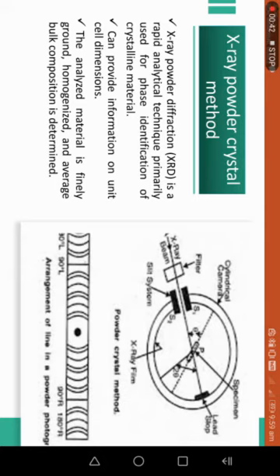So what we are changing here: earlier we were saying that lambda was changing, because of which Bragg's condition was satisfied, then theta was changing because of rotation. But now what we are using is the crushed form, which will help in promoting different angles at which Bragg's condition has to be satisfied. So this is the condition here.